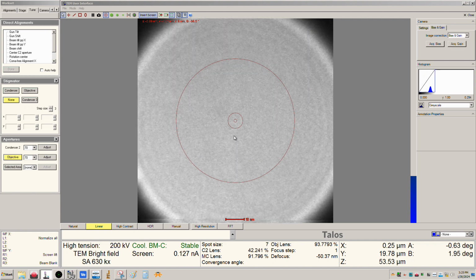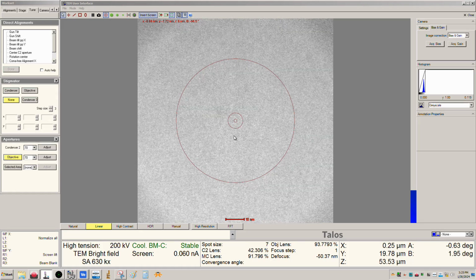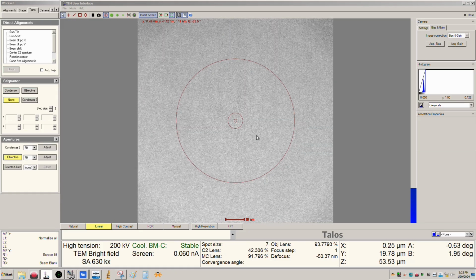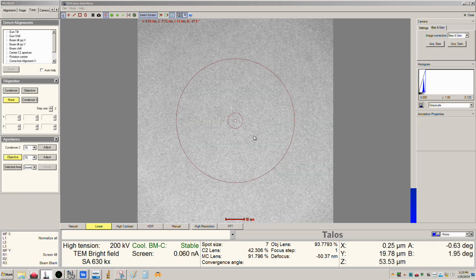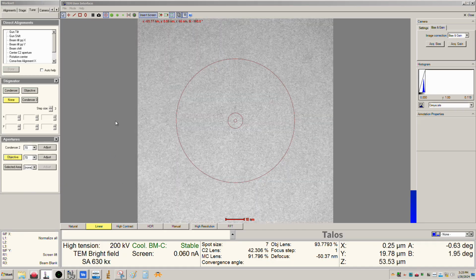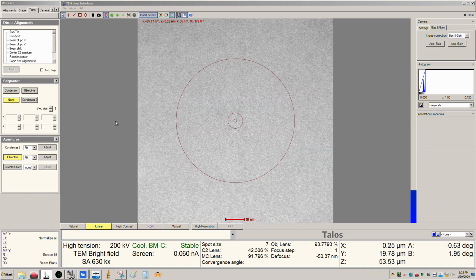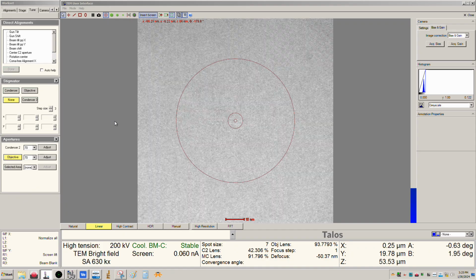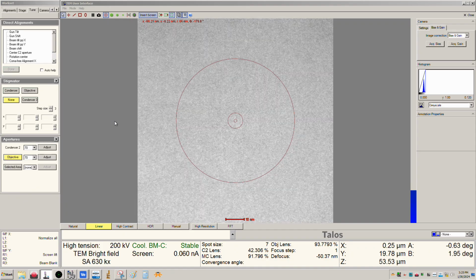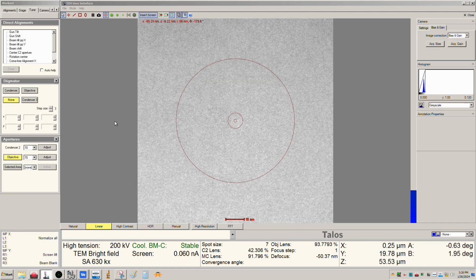is just a little bit of a discussion of beam-induced damage, right? How we see it, and how it can be generated. Truthfully, I was pretty surprised that it took as long as it did to get that damage before. Again, the area was a little on the thick side, so that's obviously going to be a contributing factor as well. Something that's thinner is probably going to hold up a little bit less resiliently.